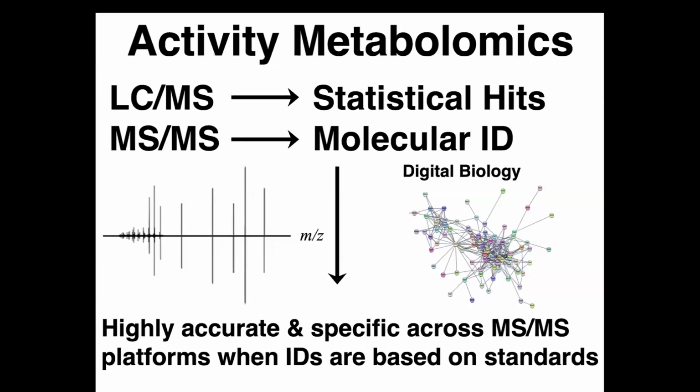However, with respect to metabolomics, I think this is where we're really lacking, but this is an avenue forward where, instead of relying on similarity or in silico-based annotation, we strictly rely on MSMS data, whether it's coming from the NIST database, Metlin or wherever. We only do annotation or characterization of these molecules based on what I would consider more experimental data, which is from standards, which is going to give you more solid identifications.